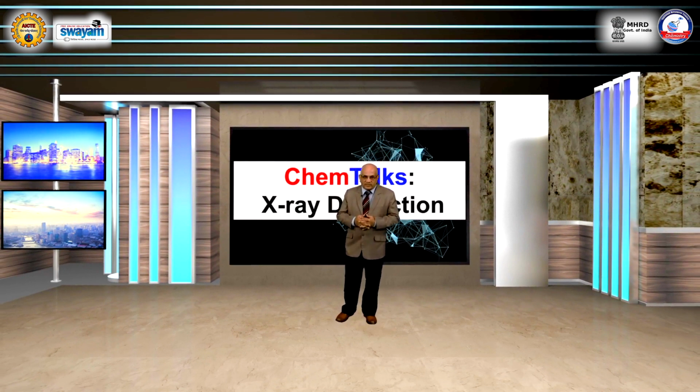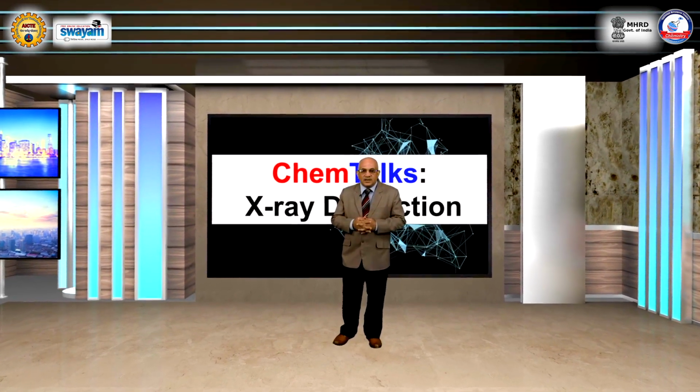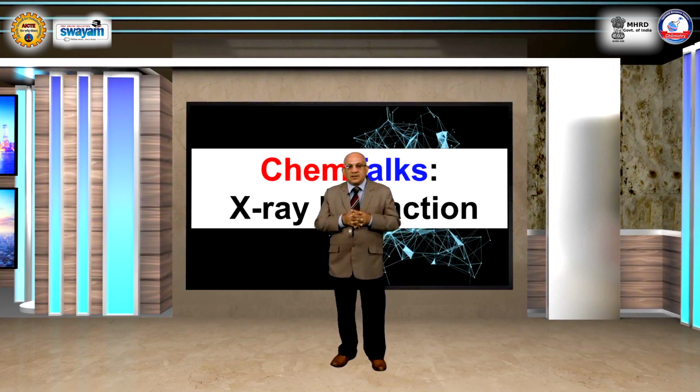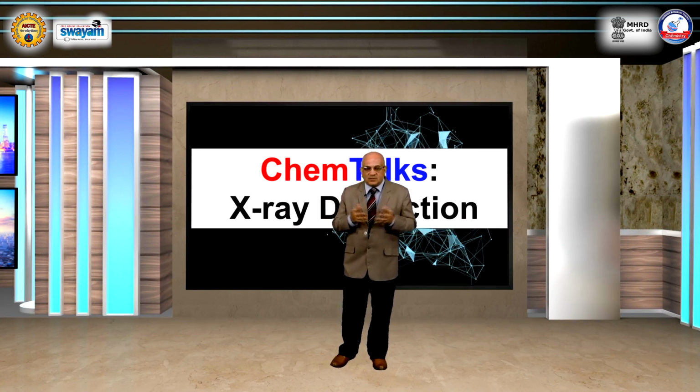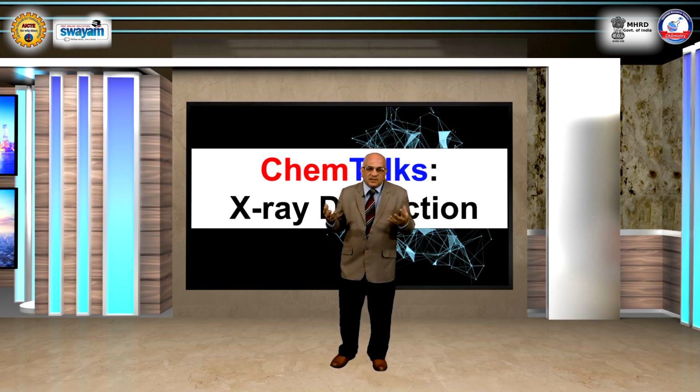We can easily find out the crystallite size of materials, which is very useful in today's world of nanomaterials. You can find out mixtures of phases, so you can find if a material has been adulterated. You can take 2 pharmaceutical crystals and find out if anything else has been added.